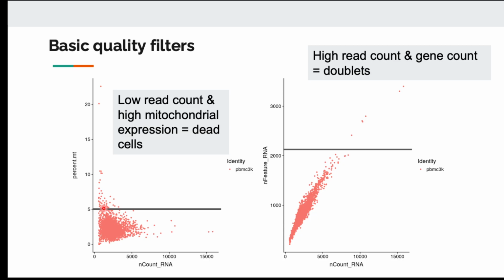But people allow you to do this by eye, because you are going to have 5,000 cells, and you are removing maybe 1% or 5% of the cells, it will not matter much because most of the data is still going to be driving your analysis. So whether you push the threshold up and down, like 5% to 6% or 5% down to 4%, it's not going to change your result much.